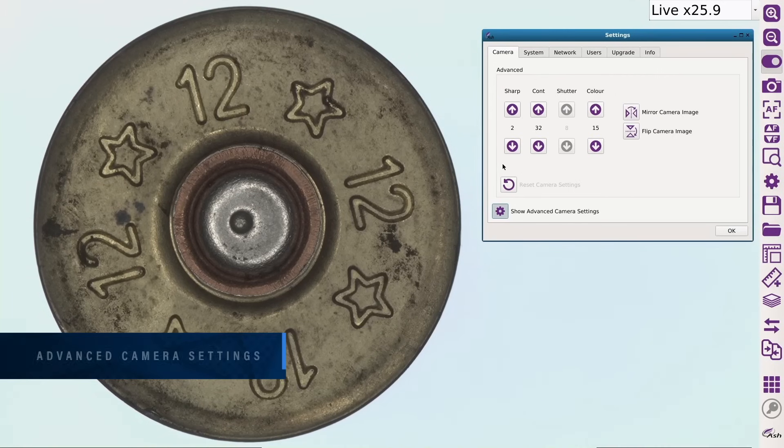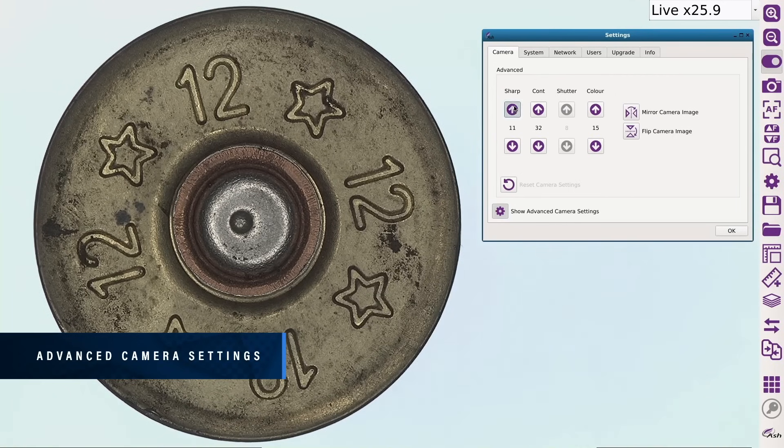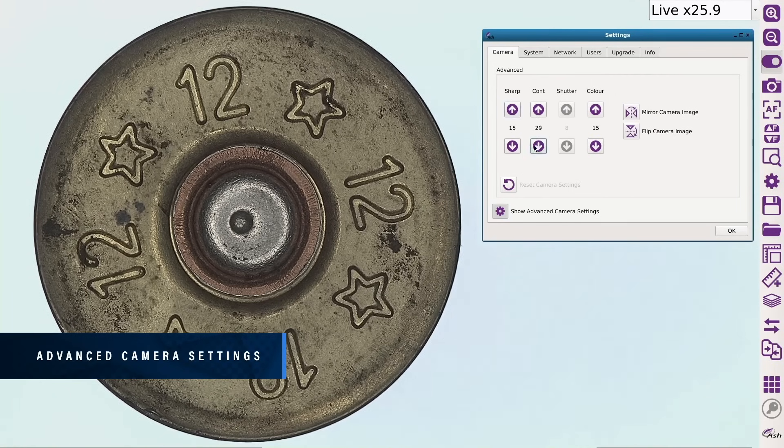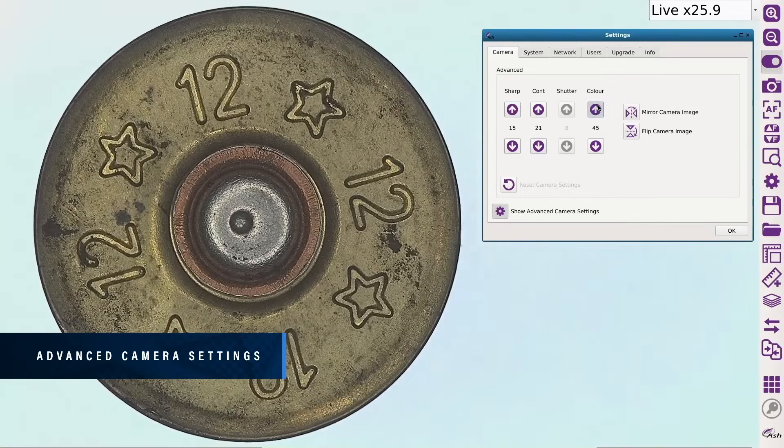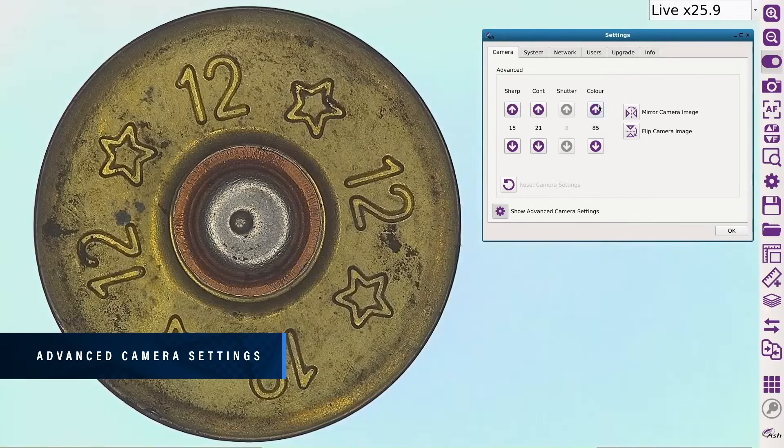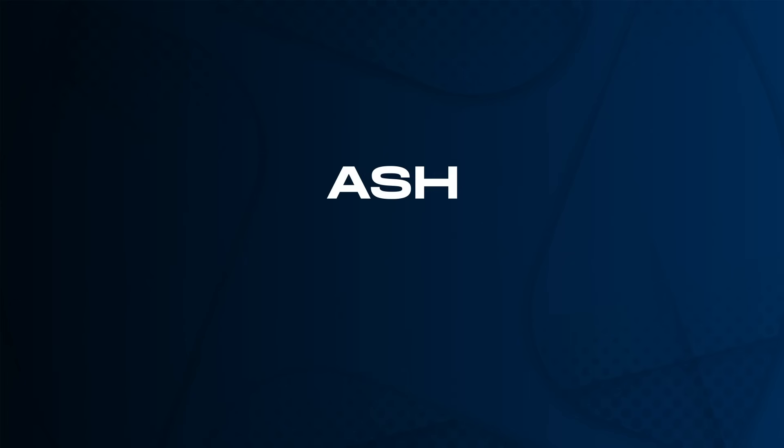Advanced camera settings give the user more power to enhance the image for a multitude of inspection and measurement requirements. Omni 3, simply smarter.